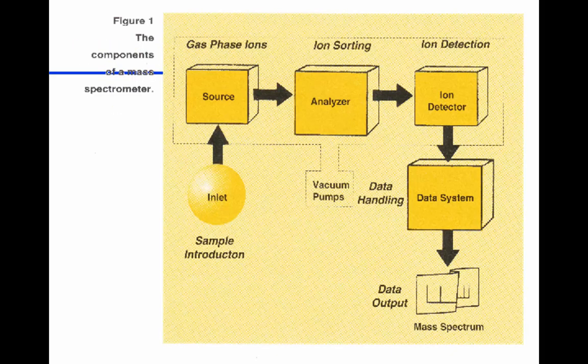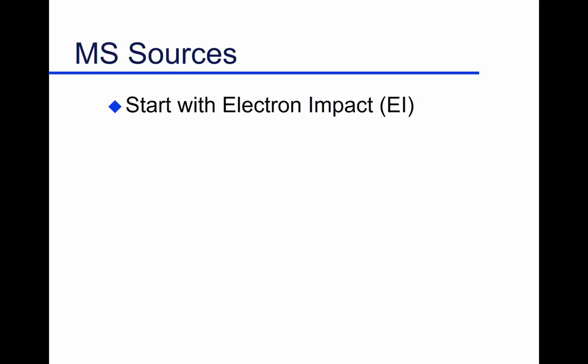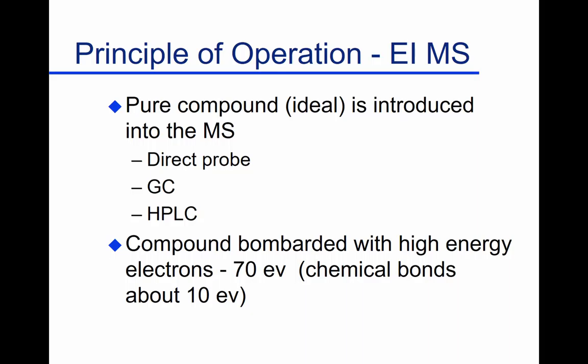I'm going to go through these pieces one by one to give you a little bit of appreciation of what they are and how they function. And we're going to start with electron impact. So I want to use a source that depends upon electron impact to make it blow into bits. So let's start with that. It is probably our oldest method of ionization. It's one of our most useful methods of ionization.